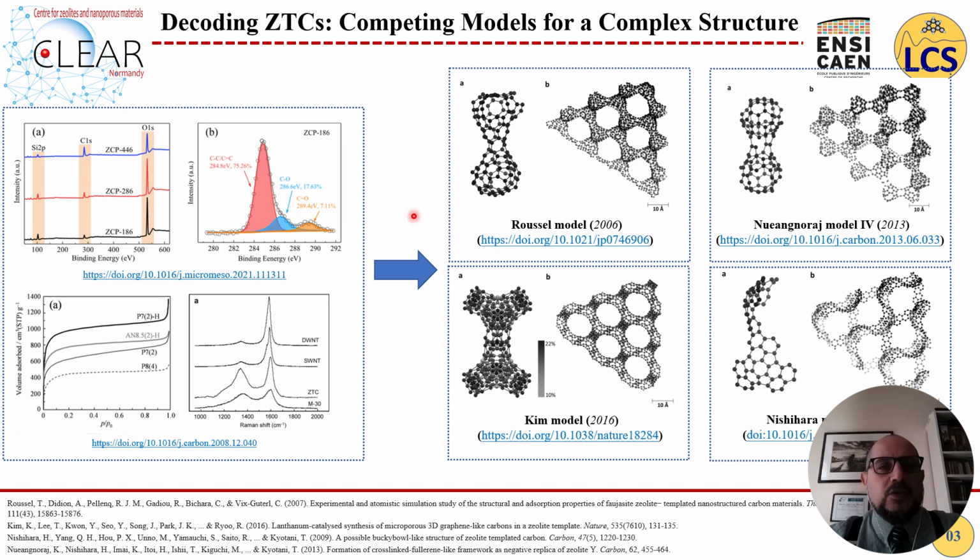All these models are supported by various physicochemical techniques like XPS and Raman, which provide insight into bonding environment and carbon hybridization. However, one of the most useful techniques, FTIR spectroscopy, which could offer valuable information on functional groups, especially for oxygen and nitrogen containing species, has been largely underutilized due to the strong absorbance and light scattering caused by the black carbon mass.